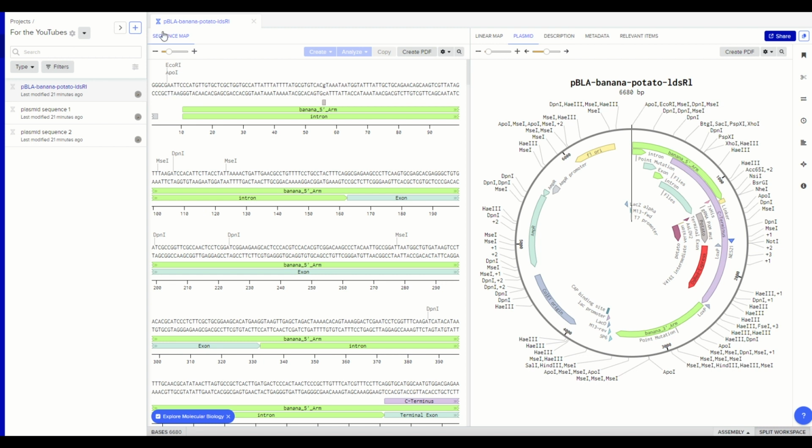So here's how to align using Benchling. You can import your files into Benchling. You can actually just import your template, and here, I'll show you. So here's your sequence, here's the map. It's pretty similar to SnapGene. Not quite as clean and nice, I don't think, but it's pretty close. This is not terrible.